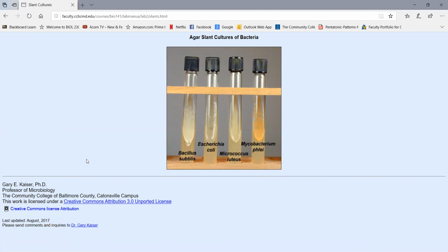You sterilized the loop after you put the bacteria on, or you did something wrong in the process, because obviously the bacteria should grow on the agar. So again, just observe your slant tubes, make sure all bacteria grew.